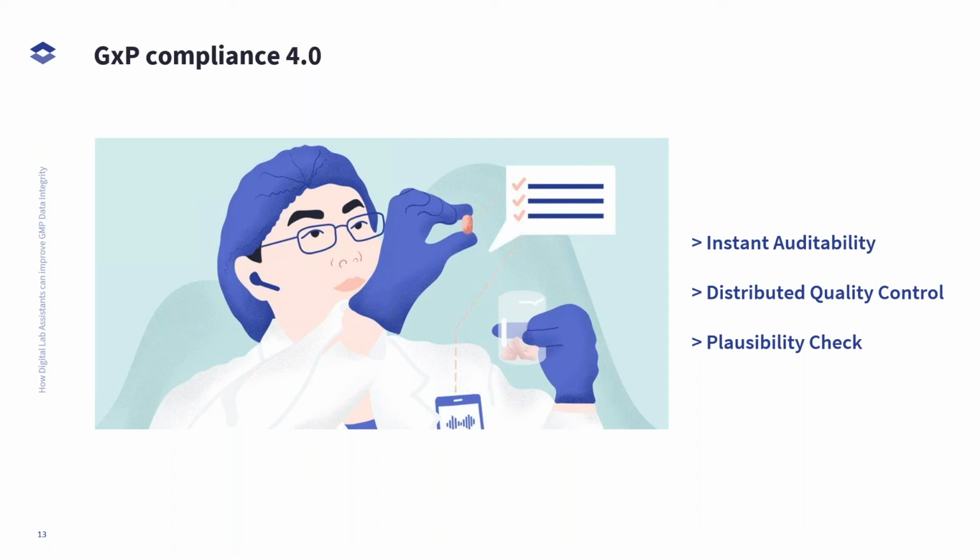You're really working on the cutting edge there with LabTwin. So what do you see in terms of the future of GMP compliance? Yeah, I think when you're looking back at what I described at the very beginning of the presentation, what the inspectors are usually looking for during an audit is mostly plausibility. So they're looking back, in the example I've just described, over the balance, a series of weighings.